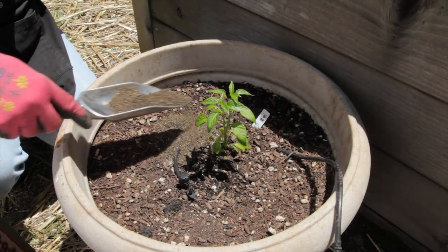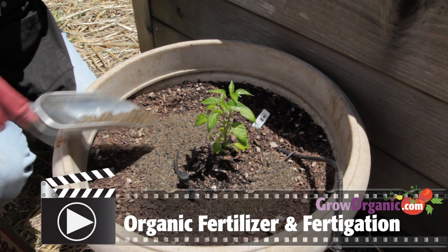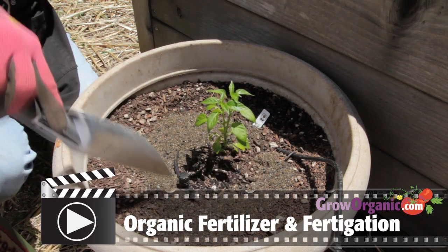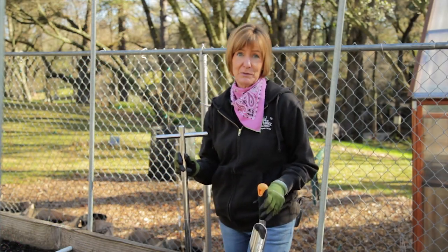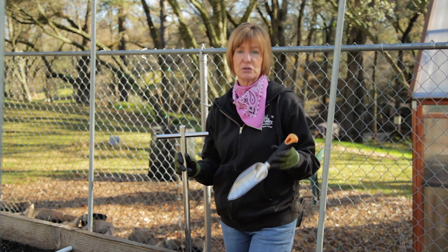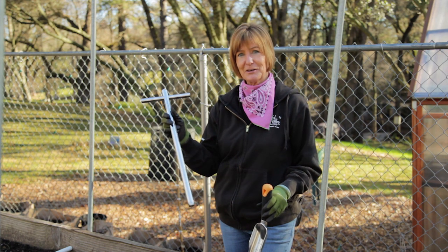For more information about the vital nutrients, what they do, and how to add them to your soil if you have a deficiency, watch our Fertilizing Organically video. Your soil test is only as good as your sample. To take a good sample, you want to use a clean stainless steel tool like a trowel, or if you're doing a lot of sampling, you can get this soil sampler.